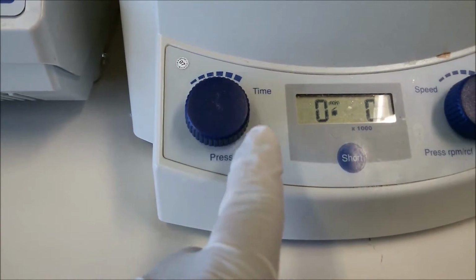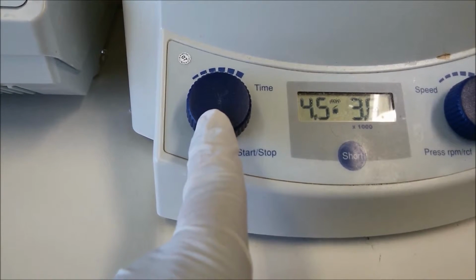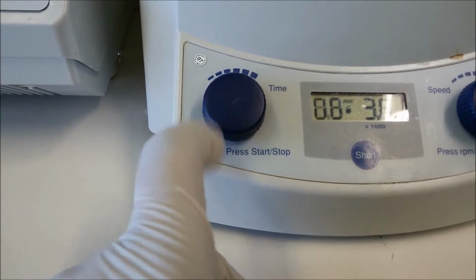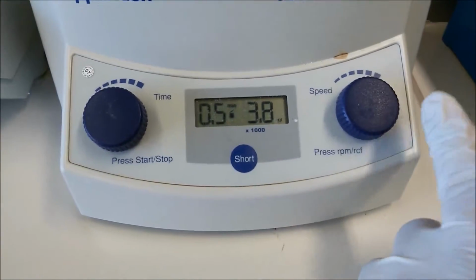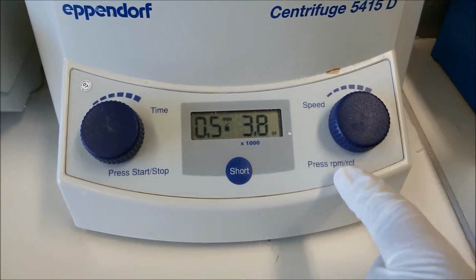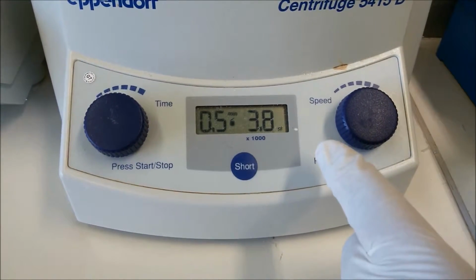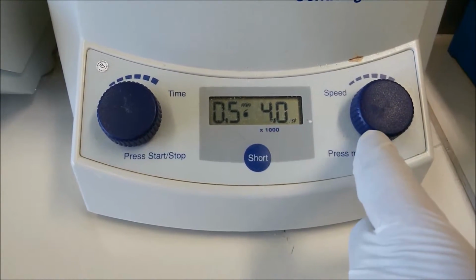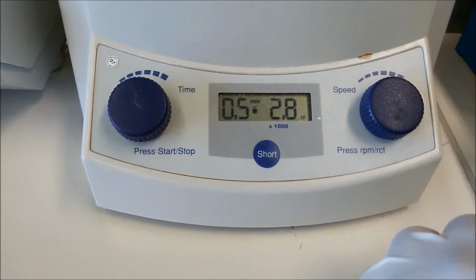Here it's written time, so you can also adjust the time if you want to rotate it for more time. So let's say you want to do it 5 minutes, 14 minutes, 20 minutes, or whatever time you prefer, you can choose it. Then in the display there's a second thing where you can adjust the RPM, so how fast you want to rotate it. Right now it is set at 3800 RPM. You can also increase it, you can decrease it. So just remember the RPM.